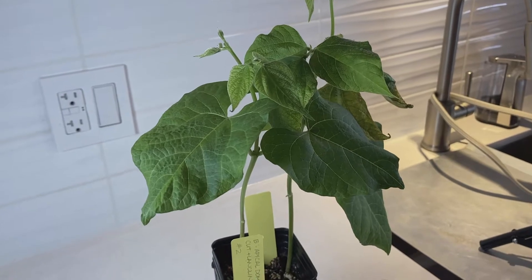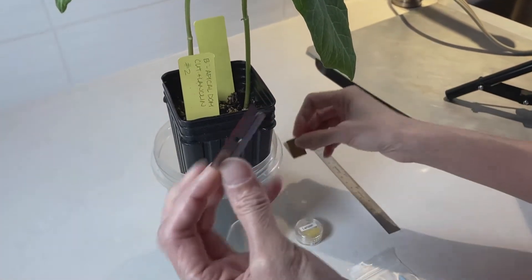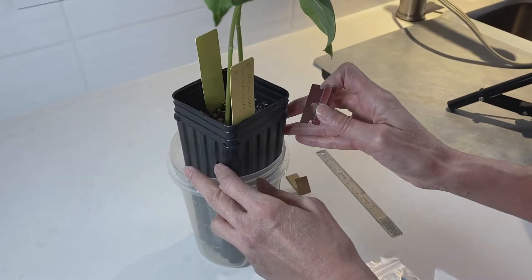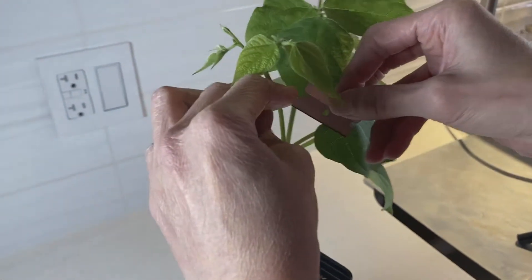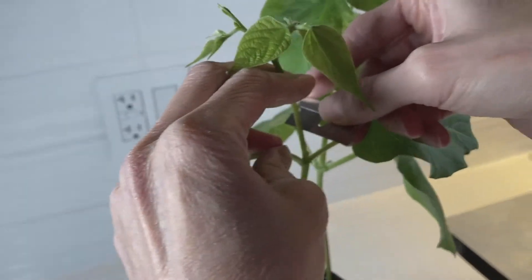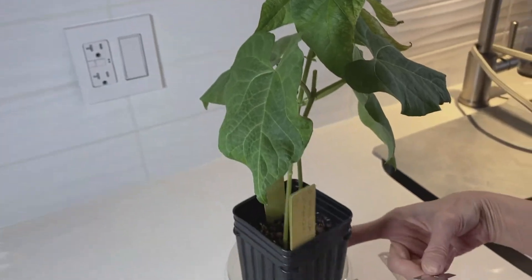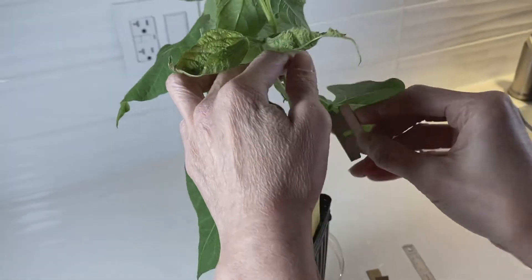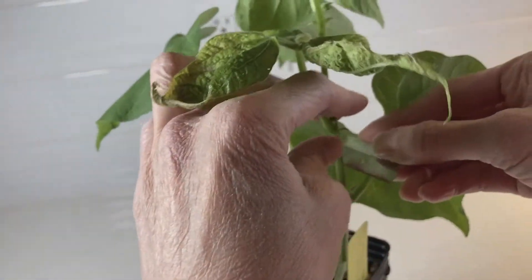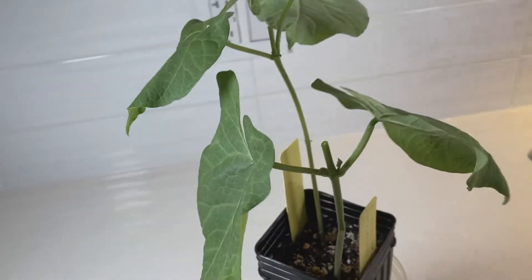To start, take your razor blade and unwrap it. Be careful because the razor blades are quite sharp — I don't want you cutting yourselves. What you want to do is cut the stem about a centimeter above the primary node. Discard that tip, and for the other plant we will also cut about a centimeter above the primary node and remove that as well.